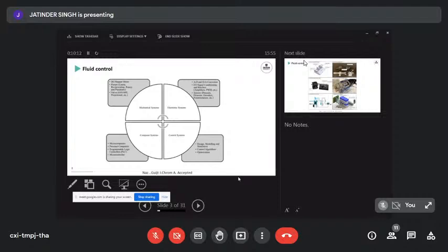And in that system, we've got mechanical systems that are quite obvious as an analytical chemist that you need for control. We may need a pump, we may need some valves, we may need some stepper motors to move detectors around or not. But these don't work just by themselves. So they also need electronic systems.